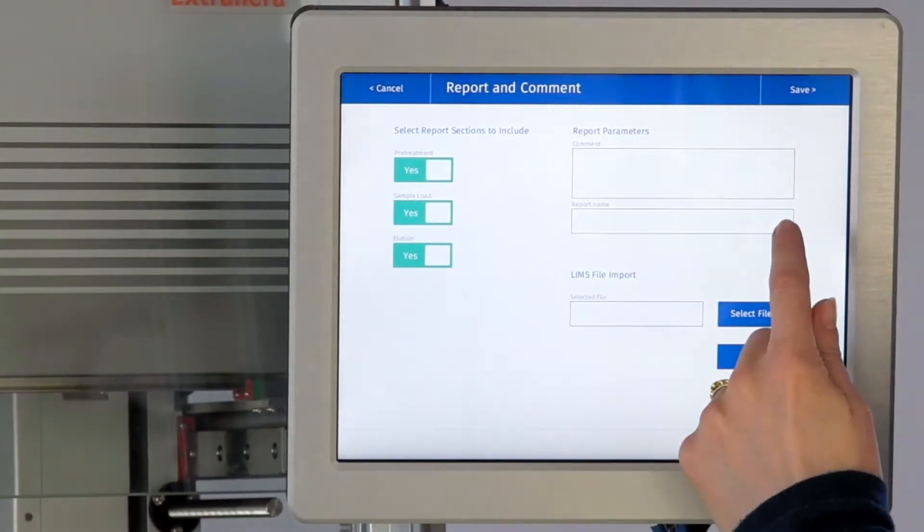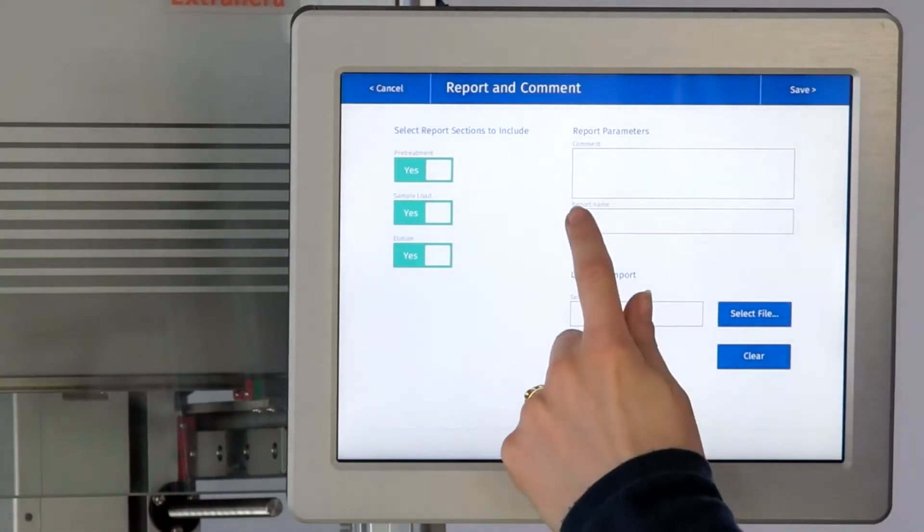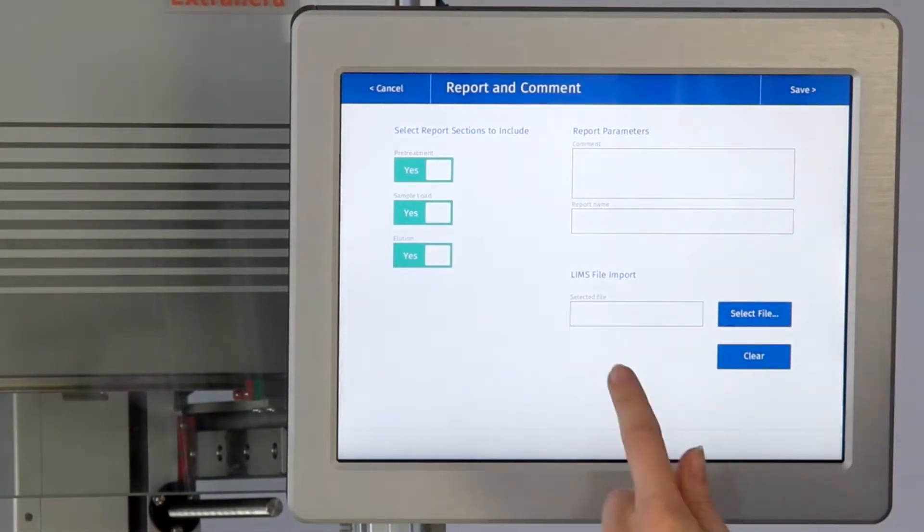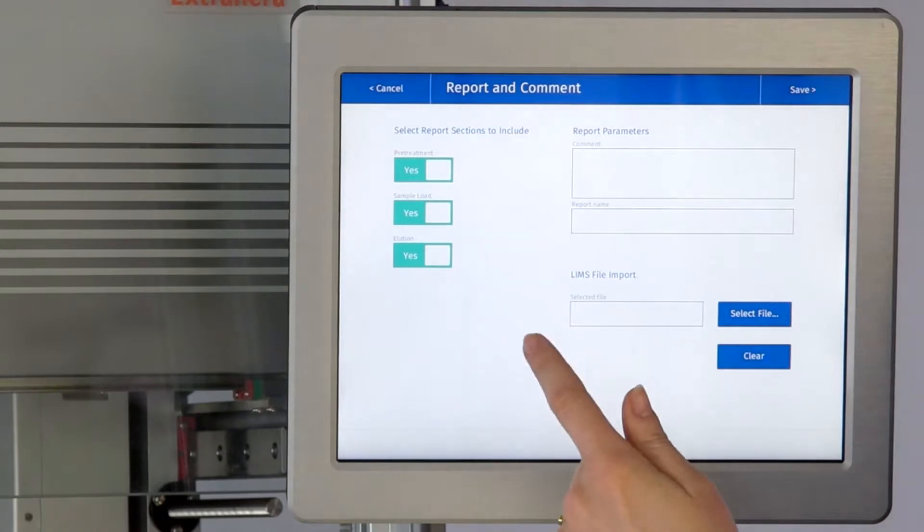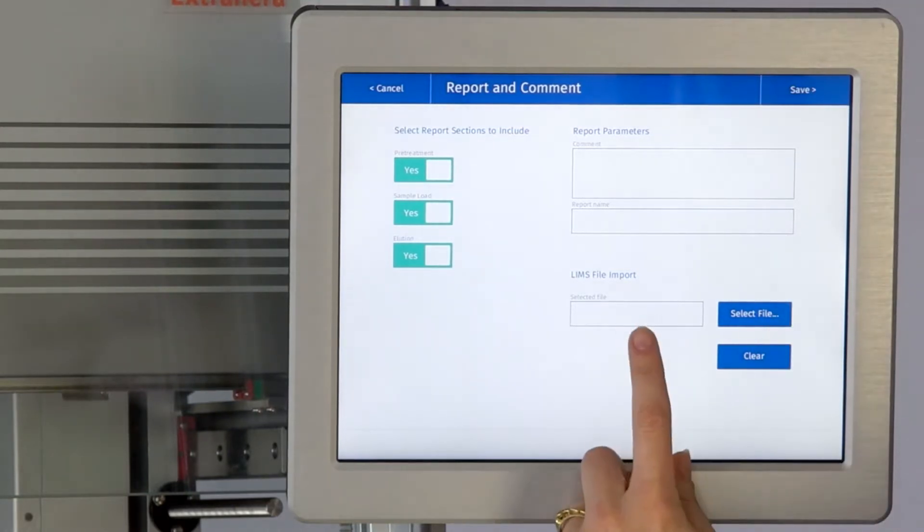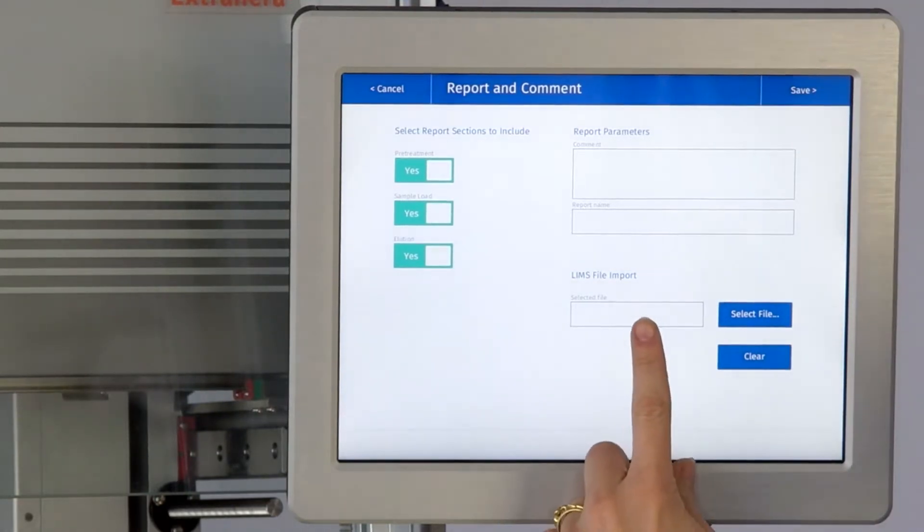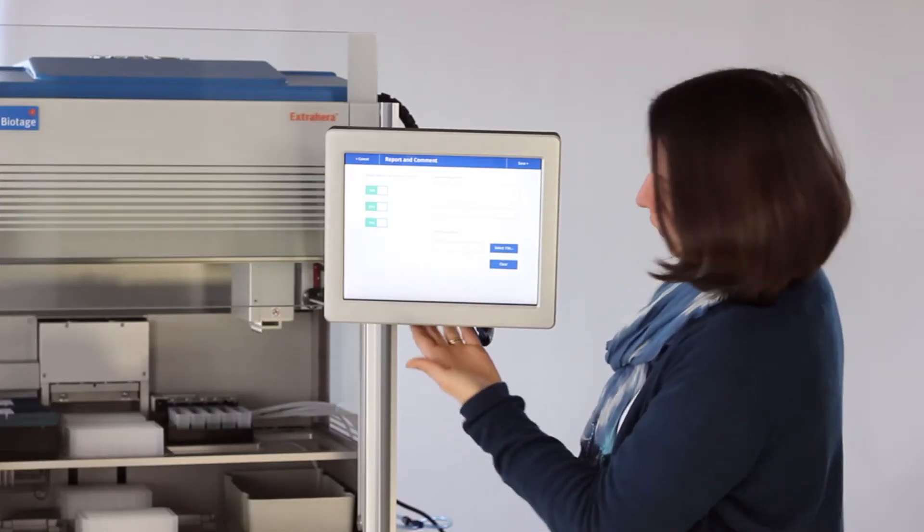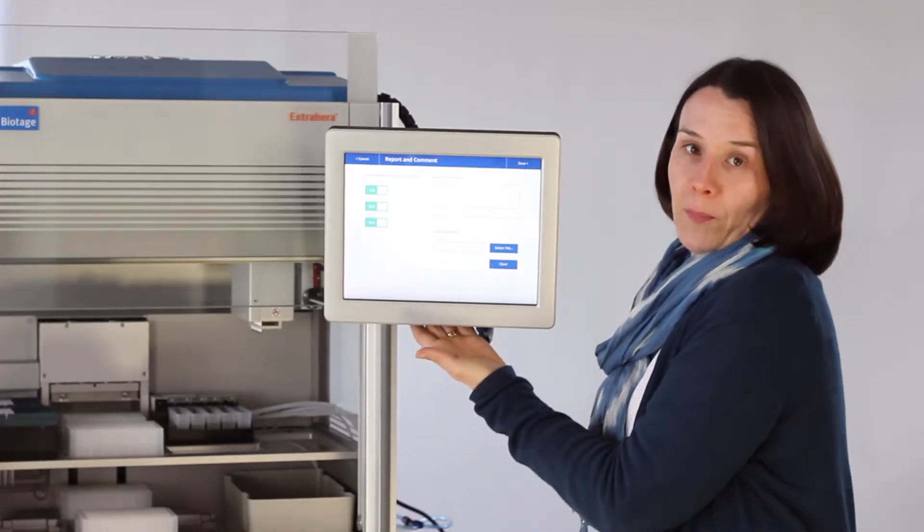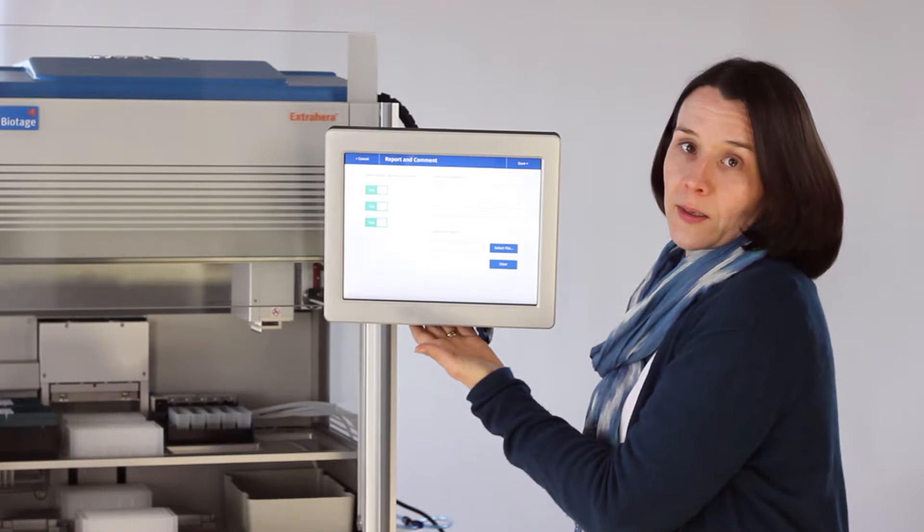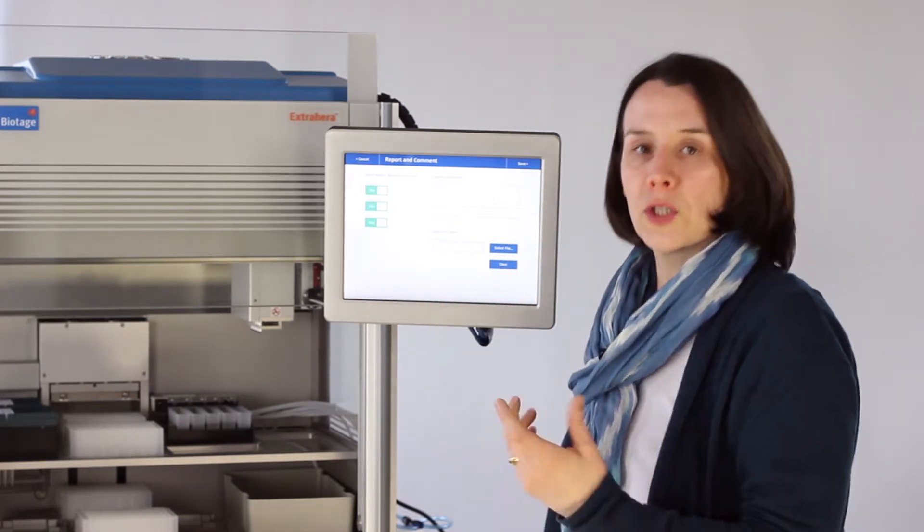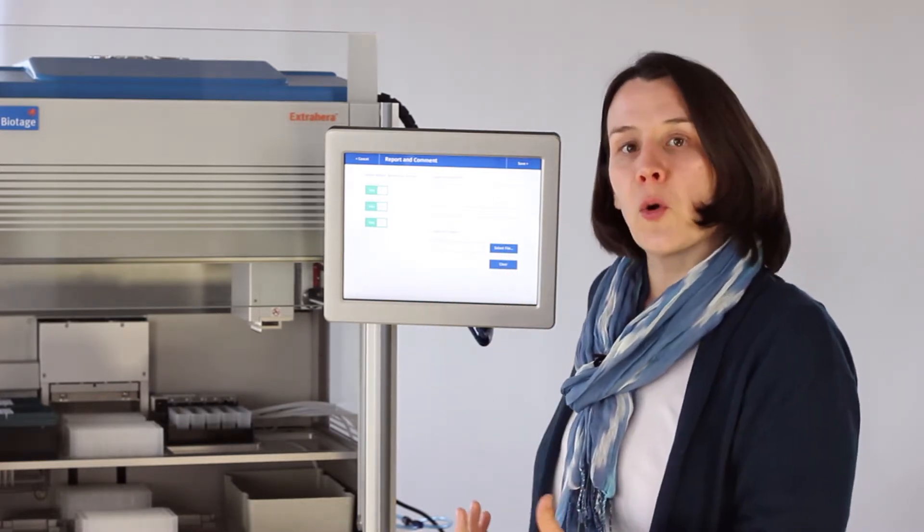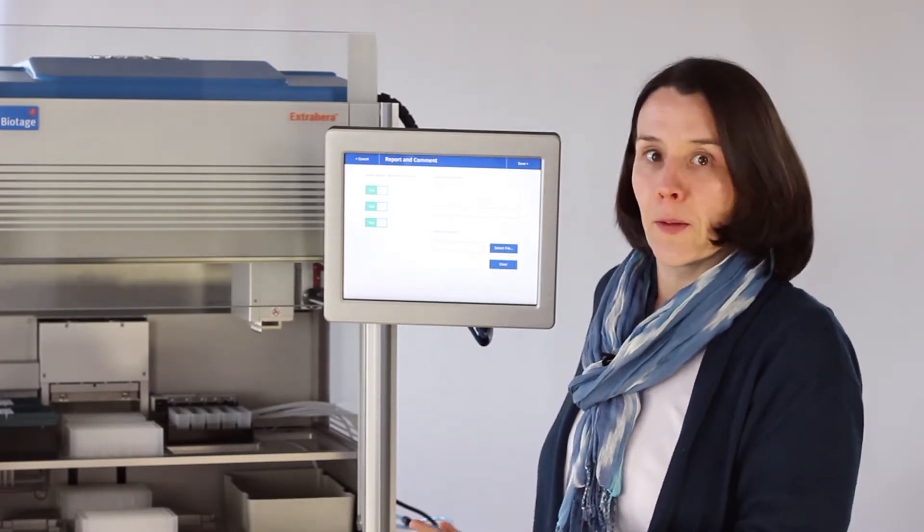Again you can do the same—you've got a report name and you could if you wish import a worklist via this LIMS file and the USB port at the back of the screen. The LIMS import will just reproduce your worklist in the report.